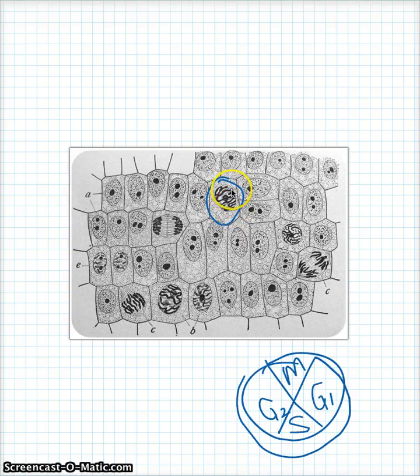So, that's how we can tell the difference from prophase and then interphase. Here's another prophase. It's a little bit earlier in prophase. Again, you can still see the little nucleolus, but you can start to see the chromosomes. Prophase. Look, another prophase.